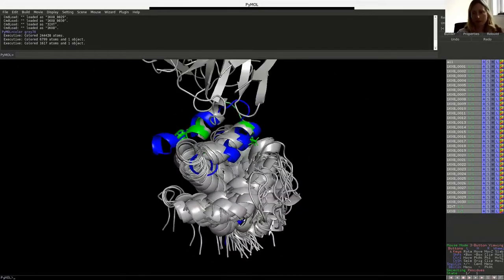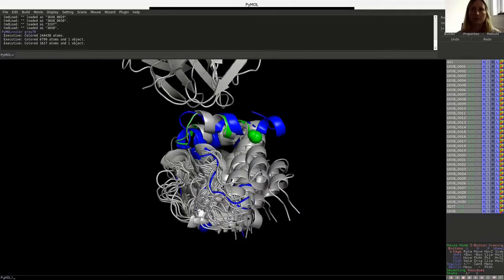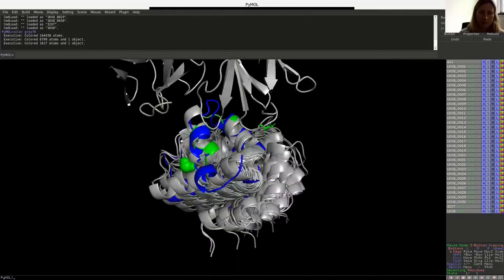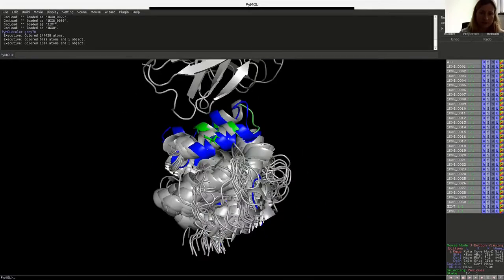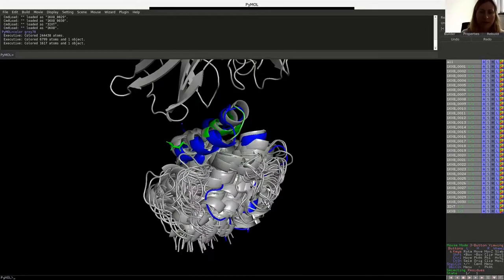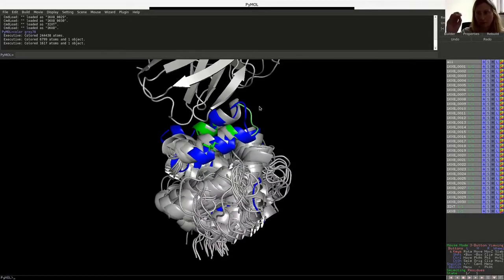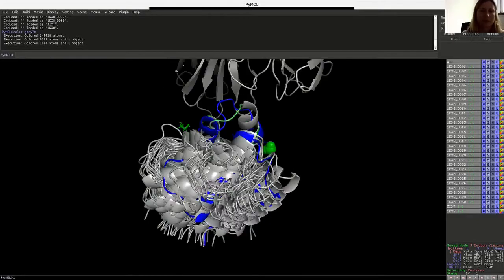Something that you can already see from these 30 outputs, which have not really been scored at all, we really ran 30 and gave you 30. Something that you can already appreciate is that the motif section has been rigid and very much defined by your protocol. So there's nothing that changed very much here. The blue thing that looks different is the scaffold. You can see everything that's gray and green perfectly overlays. This is the motif region. But you can see how Rosetta really sampled a huge space and a lot of options on how to use the scaffold in order to stabilize this motif.